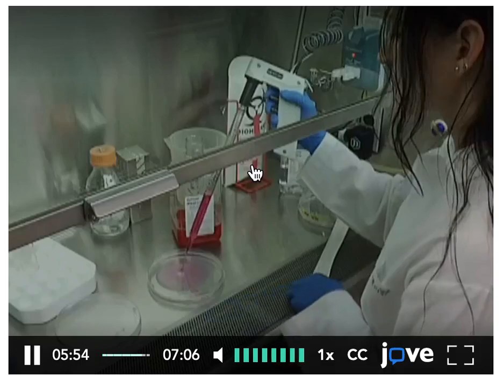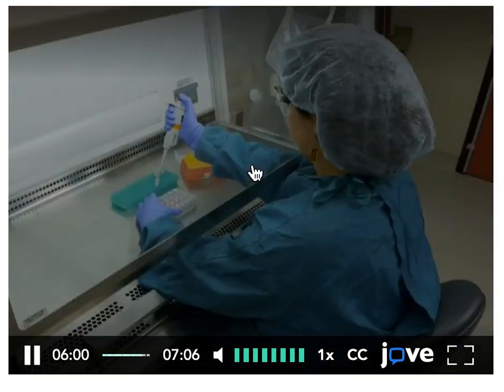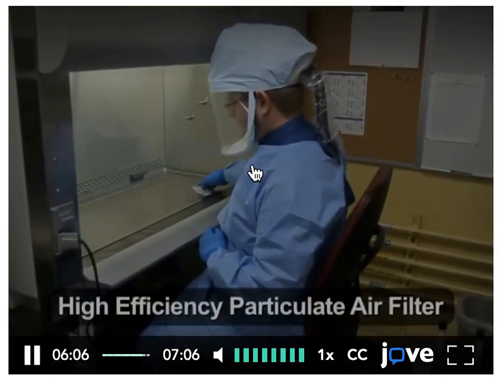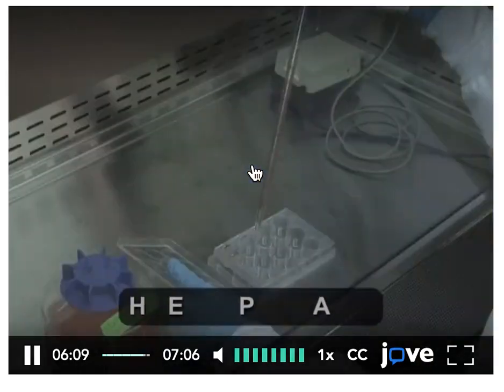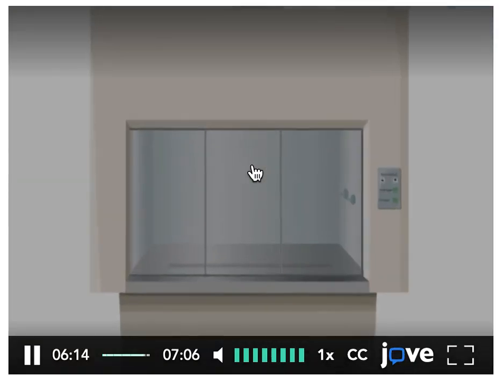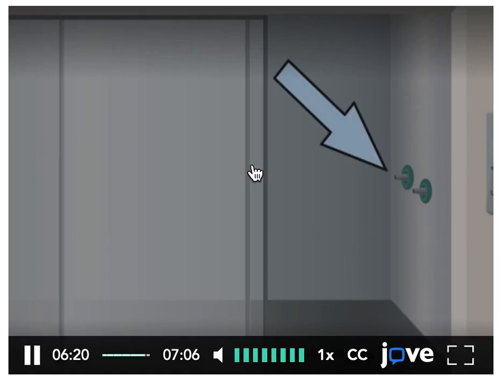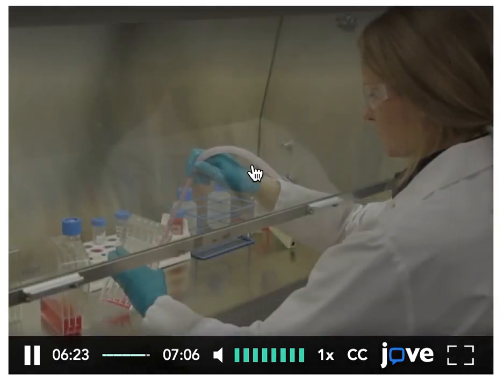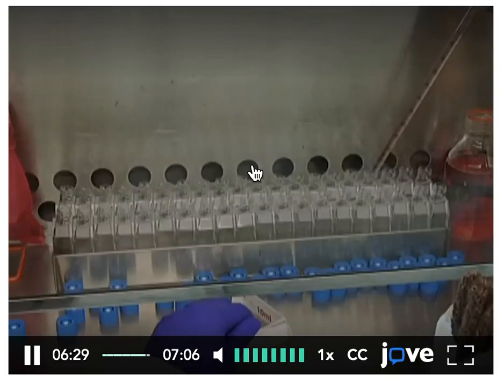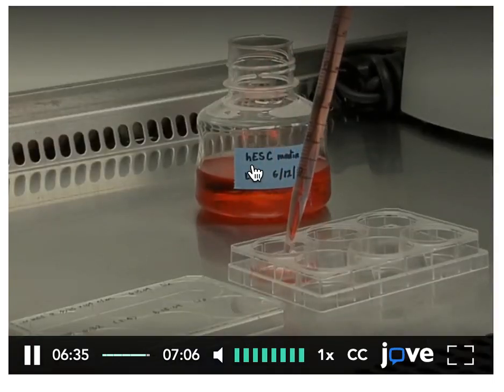As you may have already guessed, tissue culture is typically performed within the tissue culture hood. These units maintain the sterility of the experimental workspace. All air is high-efficiency particulate air filtered, or HEPA filtered, as it both enters and exits the cabinet. Many biomedical research labs have tissue culture hoods that are equipped with a vacuum aspiration system for aspirating tissue culture media. There are various types of biosafety cabinet and tissue culture hoods. Check to see what the BSL rating is of your hood before beginning a new experiment.